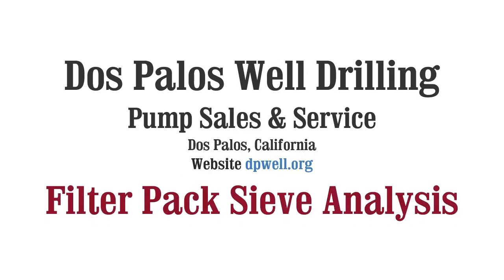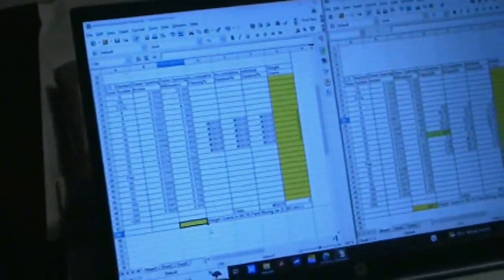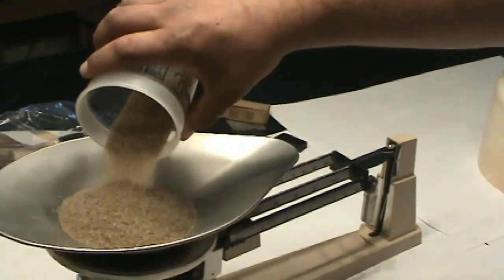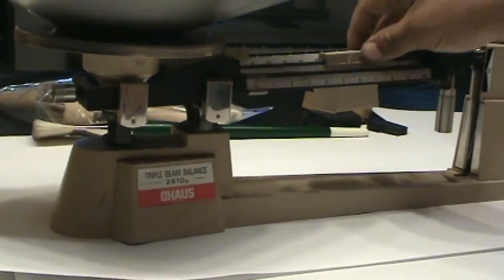We are conducting a sieve analysis on 1220 PW Gillibrand filter pack sand. My son Jared is performing the procedure. My name is Mike. The first step is weighing the sample to be analyzed. This sample is approximately 300 milliliters and weighs 330 grams.